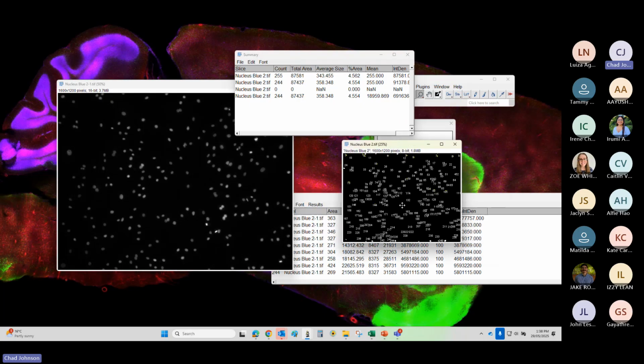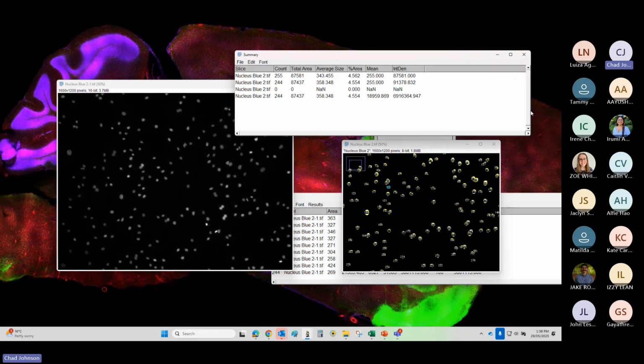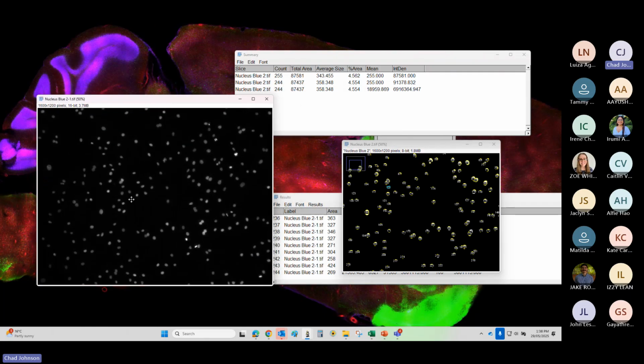So now it's actually worked because I'm doing the entire image. And we can see the difference here. That's the one that we did previously. I'll just delete that. So the mean intensity of the binary image that we were doing before was 255, so every single object has a mean intensity of 255. Now this is a 16-bit image, so the maximum pixel value we can get there is 65,000. So the mean intensity of every one of these objects is instead 18,000. So we get that vast difference from actually analyzing the original data. So redirect is really good.